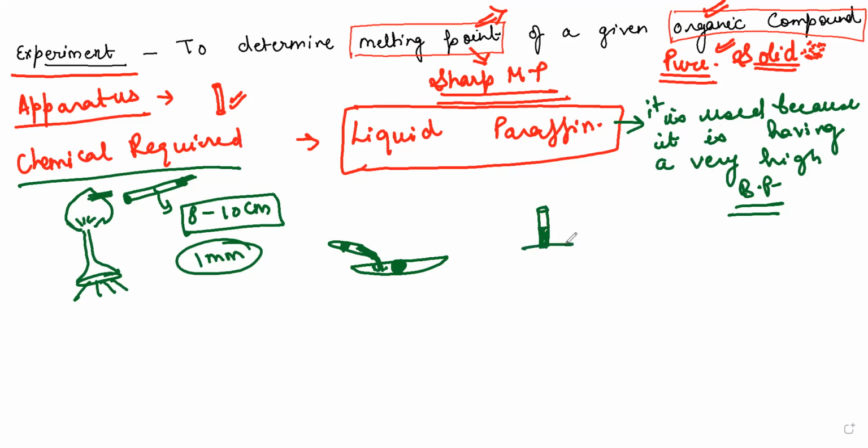Dab it properly on the surface so that the content moves down completely. And I would preferably say that you should use a Thiele's tube for performing this experiment.